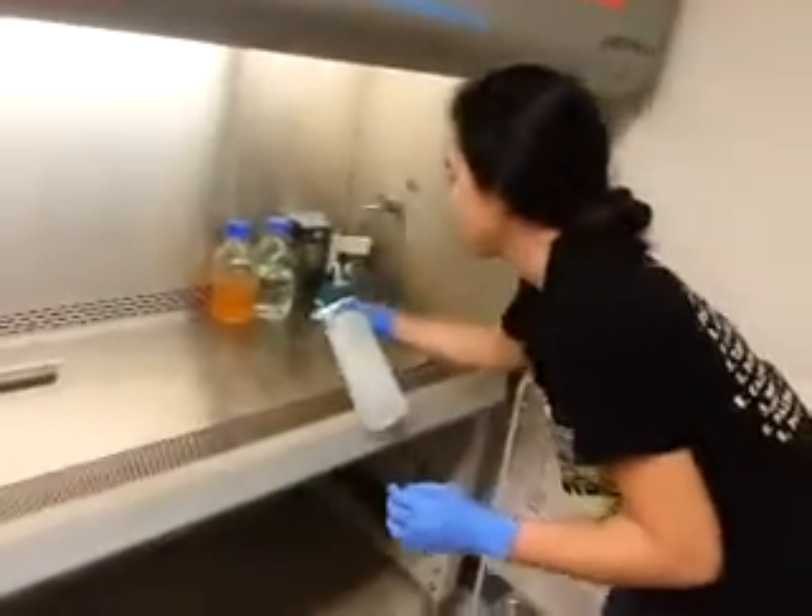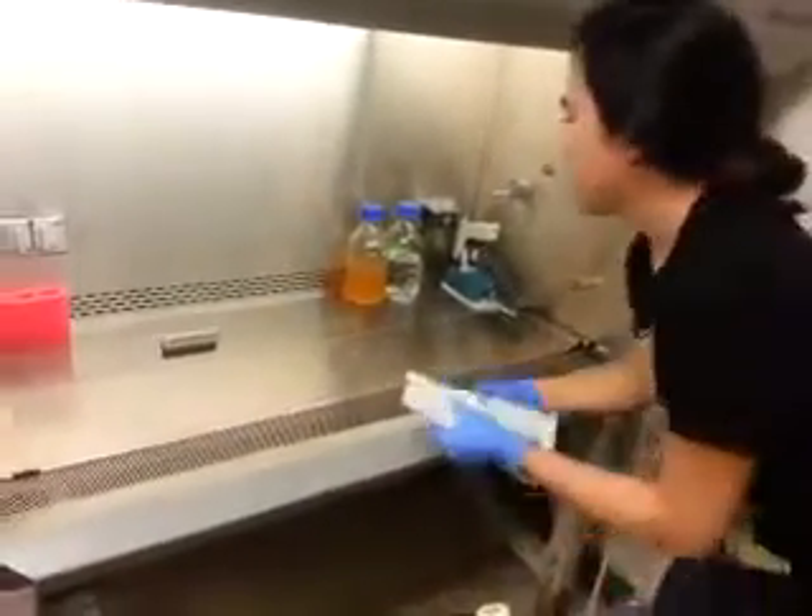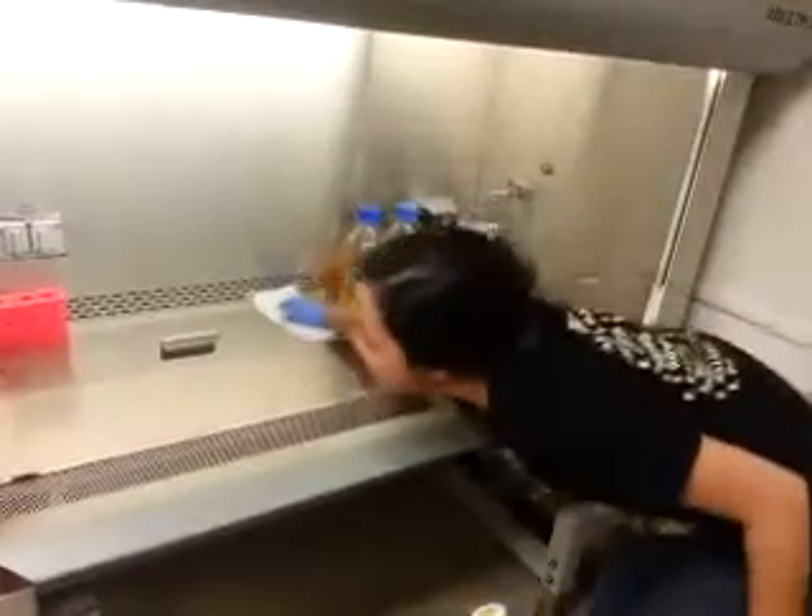Then you have to spray your work area and wipe it from outside to inside to outside, so you don't bring anything dirty to the inner part.